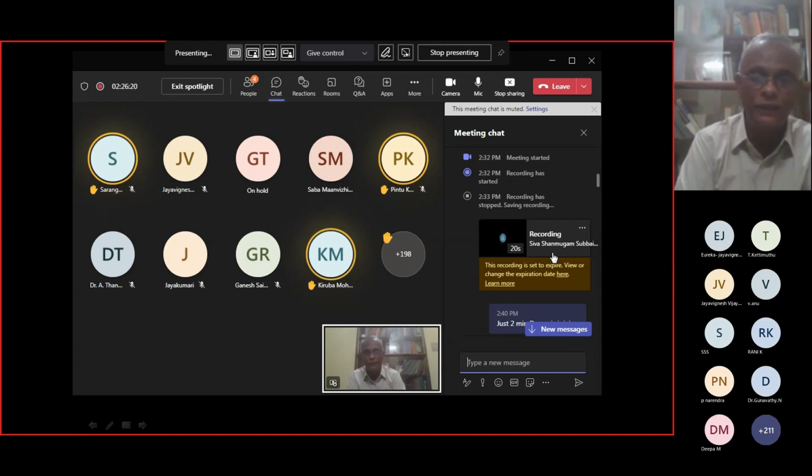I left it as such, and it is difficult if somebody is not interested in listening to you. We cannot do anything. But generally speaking, the USP accepts it. In our industries, it is commonly accepted. Many people do not accept, and many people do not come out with the feeling of saying that HPLC is far better than TLC.